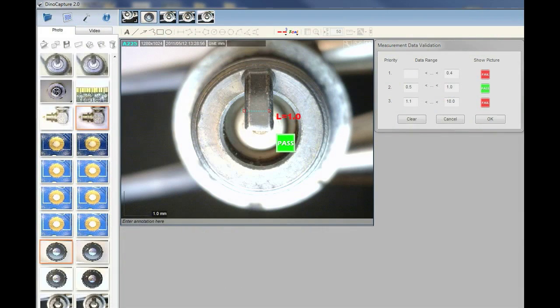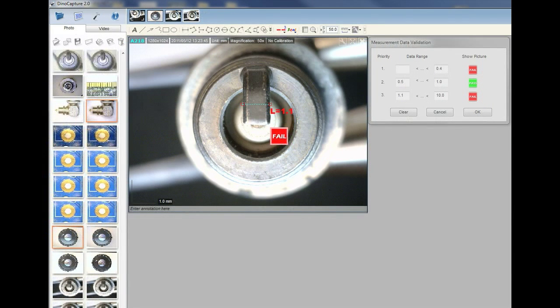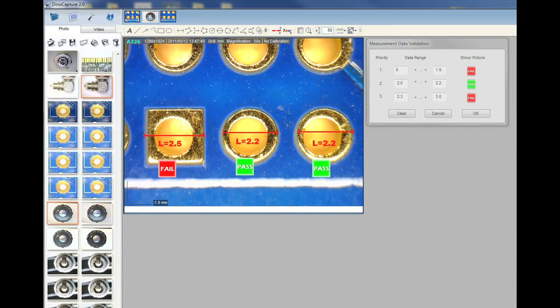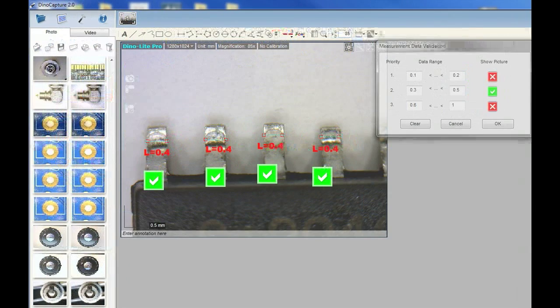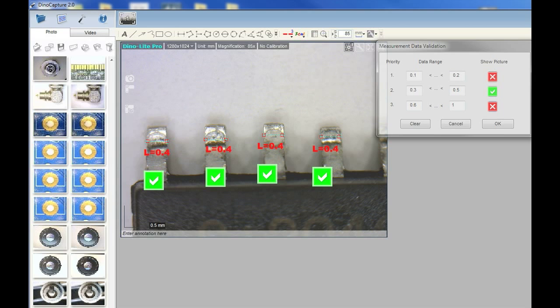This is a cool feature that's really useful for inspection and validation. I have three part samples that I'm going to inspect. Now these parts are supposed to measure four millimeters across, but two of them are defective.